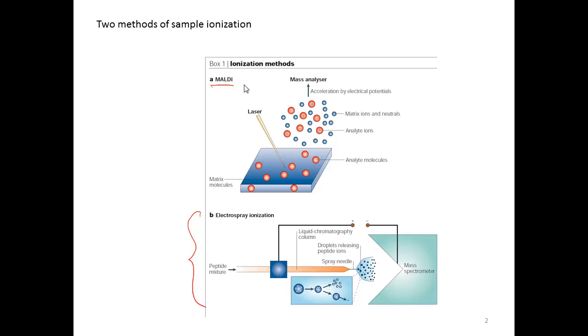And this figure is from the review paper which I assigned for reading. And in fact, all the material that relates to Maldi type mass spectrometry has been grayed out. The part that remains focuses almost exclusively on electrospray ionization.